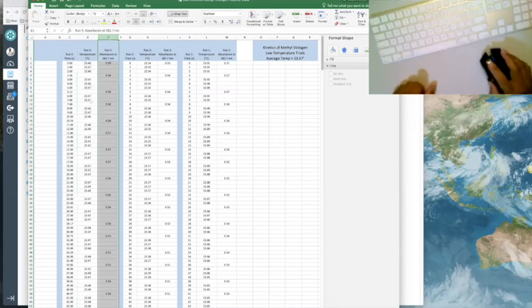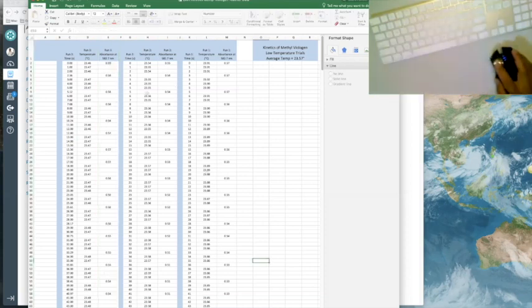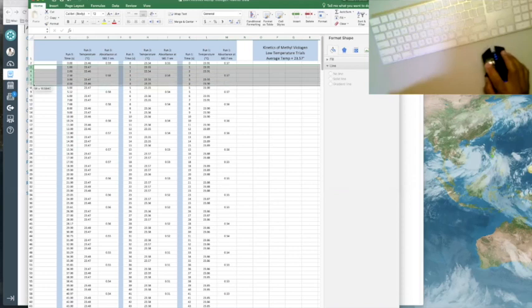So to thin this out, again, make a copy for low temperature 2. What you need to do is always select the first one, delete data, so that you're only deleting files that have blank absorbance, but enough of them so that you can thin out the data.